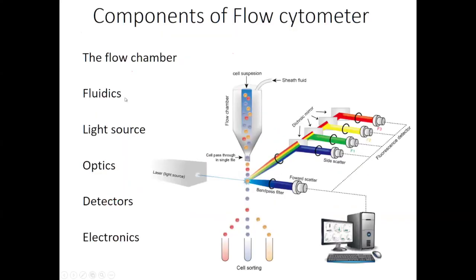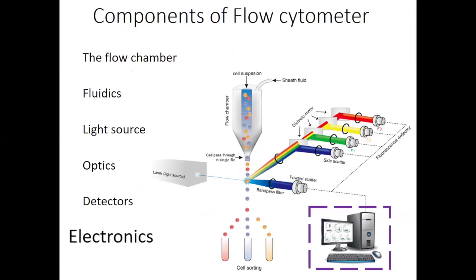So now we've finished flow chamber, fluidics, light source, optics, and detectors. Now finally we're coming to electronics, which is more of physics. I'll make it simple for you. Maybe in 5 minutes I'll finish. I'm sorry, people who are holding on.